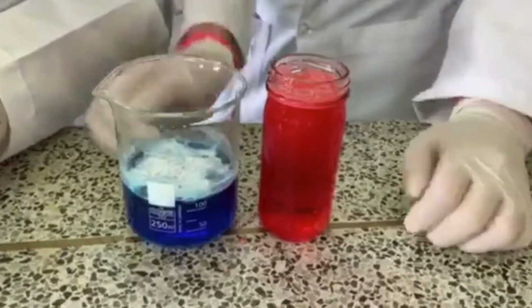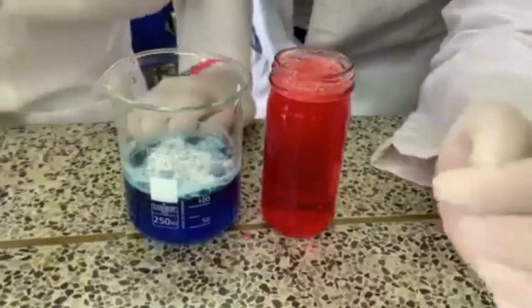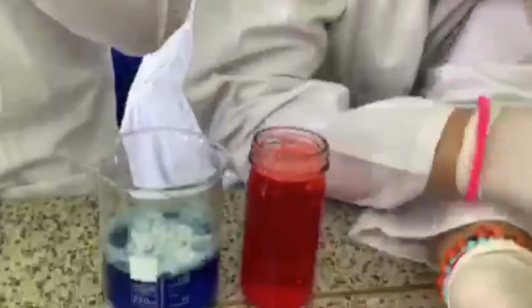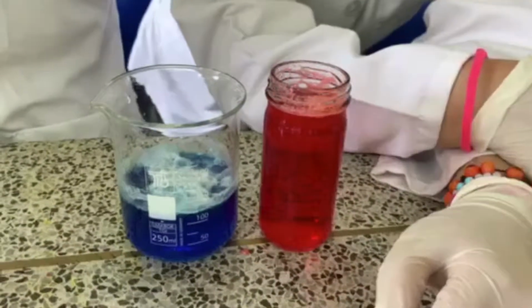While we're doing this, we're also gonna write the results to then have the conclusions. That's what we're gonna do in the third experiment.